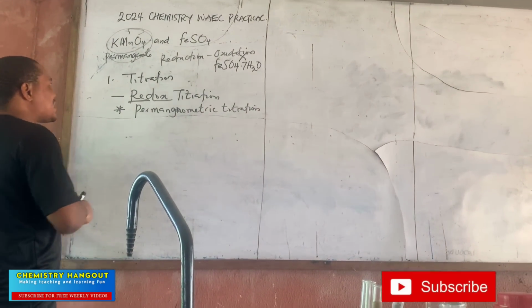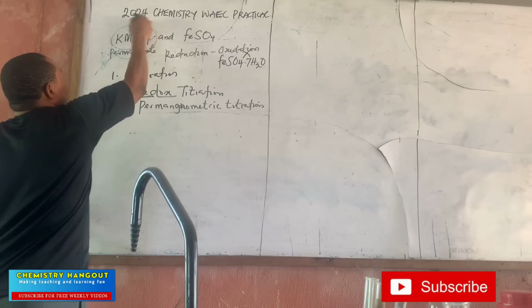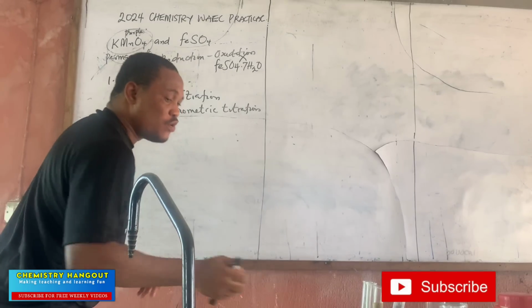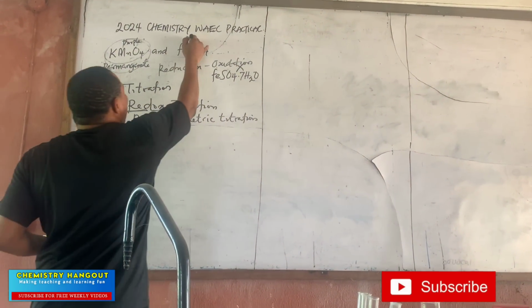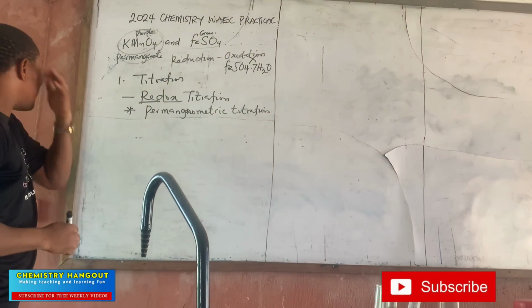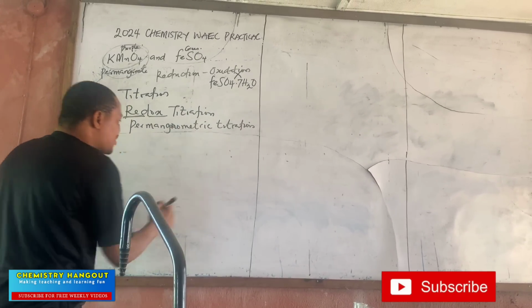So our KMnO4 is purple in color, and our iron 2 sulfate is around green in color, if I'm not mistaken. Okay, so how do we carry out this titration?